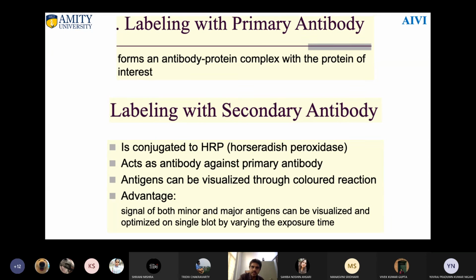So what is happening in this case? Like, this is your protein. To this protein, first your antibody goes, and this antibody is going to bind here. But this is also protein, so you can't tell them apart. So what to do? As mentioned, we have to make it a probe. We need to label this with a chromogenic, fluorescent, or radioactive substrate.